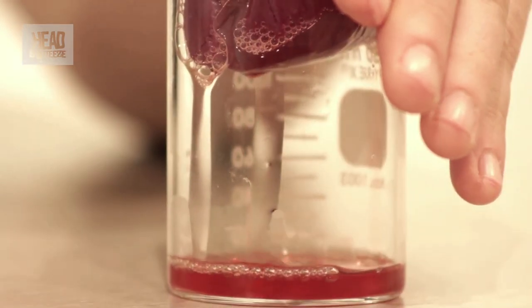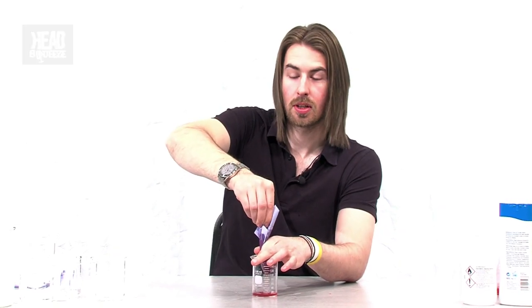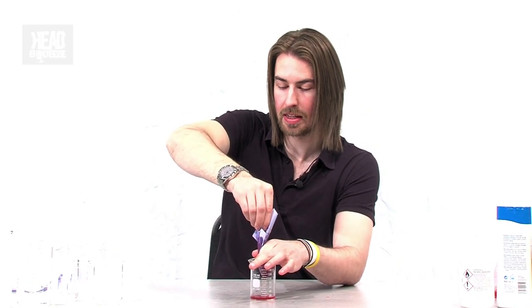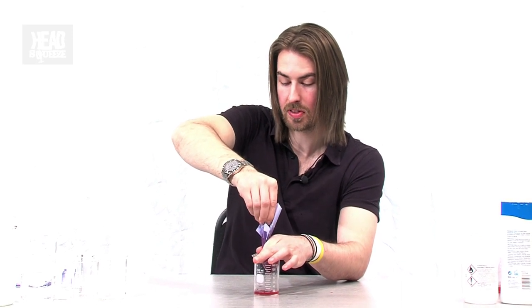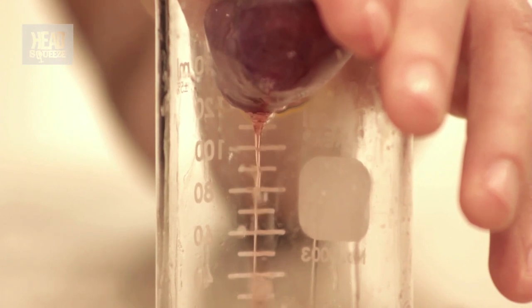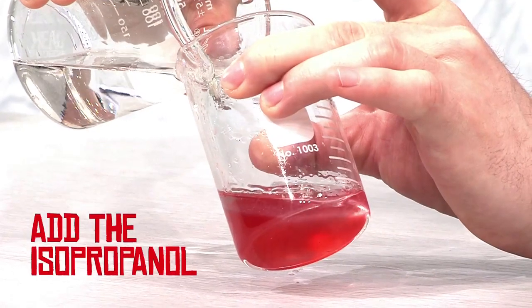The thing about DNA is it's soluble in this extraction solution, but not in alcohol. So what we need to do to get it out is add some rubbing alcohol into it as well. We should see it precipitate out and into the alcohol — it will sit on top of the solution, so the DNA should rise out.